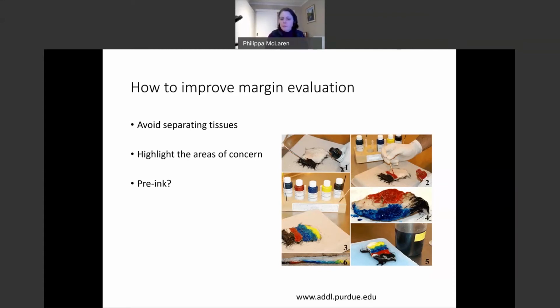You could at the same time be cutting some pieces that you consider to be particularly relevant, or you could be taking surgical suture thread that's left over from the procedure itself and using that to indicate to us the areas of relevance. What I would implore you not to do is to stick needles through it to highlight. I've had that happen a few times, and it seems all well and good at the time, but when you remember that the tissue in the formalin has now become brown and shrunken and the formalin is now colorful, the scientist reaches their hand into that pot and they might get a needle stick injury, which would be quite concerning.